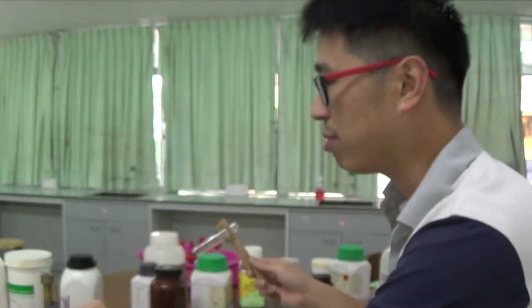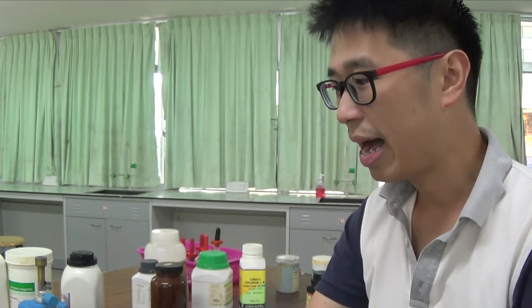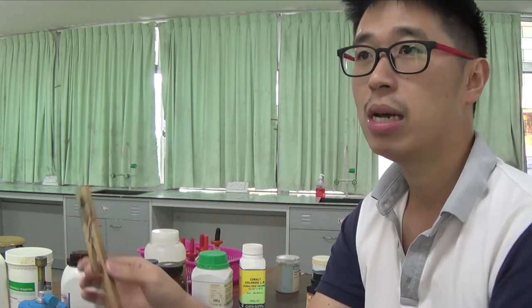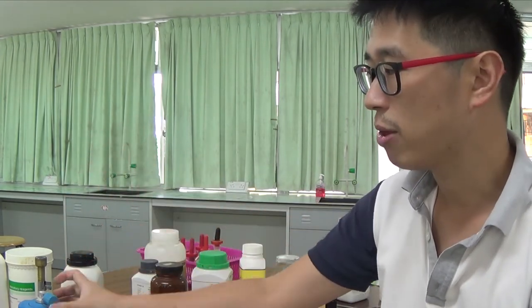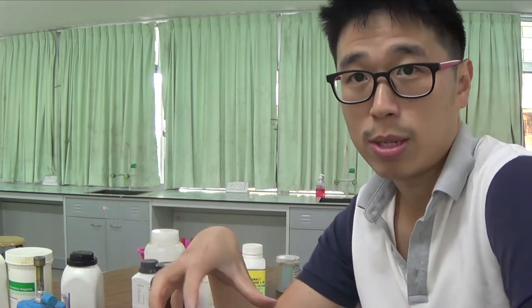Anyway, so that's it. Really, done enough tests on transition metal compound, which is colored. And they were hydrated, that's the focus of this tutorial video. I heated them and I get a colorless liquid form on the upper part of the tube. It's a result of the water being driven off by the heat of the Bunsen burner. And because the escape is steam or water vapor, boil off at 100 degrees Celsius at room temperature and pressure, right, H2O. So what happened when they reach to the colder part of the tube?